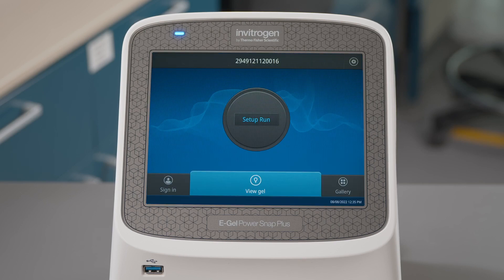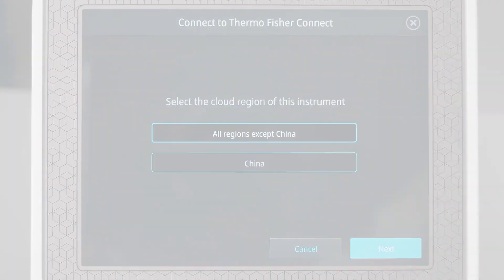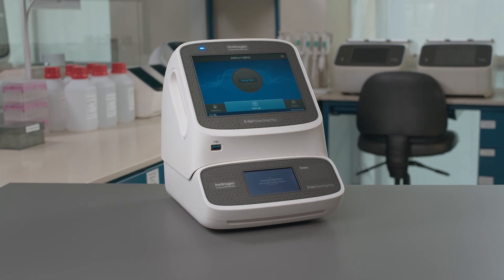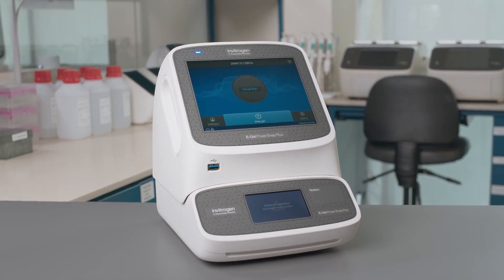Lastly, set the date and time on the camera module and select the correct cloud region. The eGel PowerSnap Plus electrophoresis system — a quick and convenient solution for high-throughput gel electrophoresis.